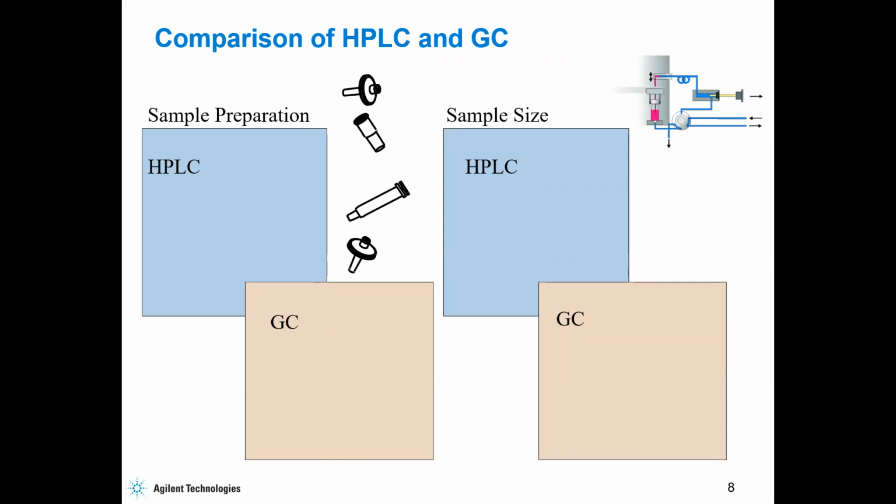So I actually wanted to ask, what does it mean for a detector to be destructive? What I mean by that is that for a detector to be destructive, it means that you can't recover your sample again.